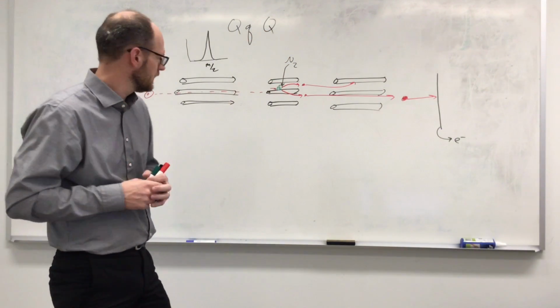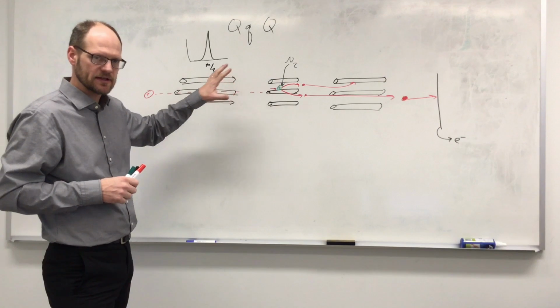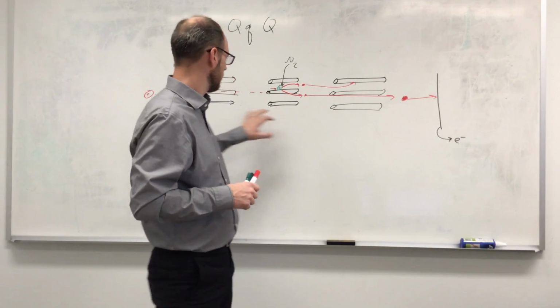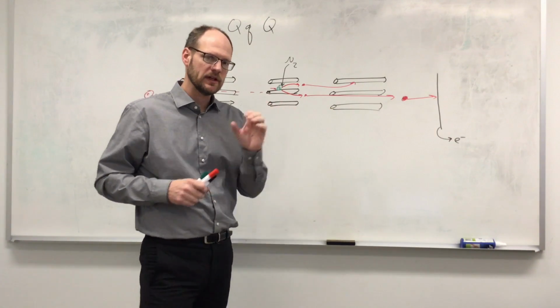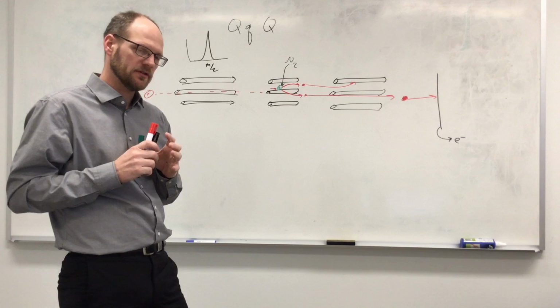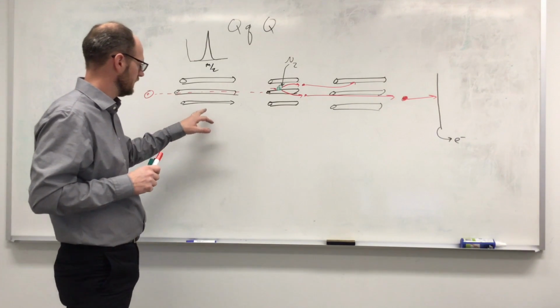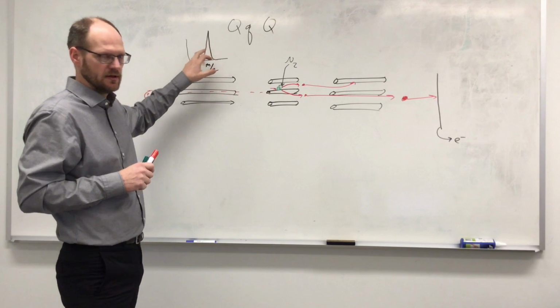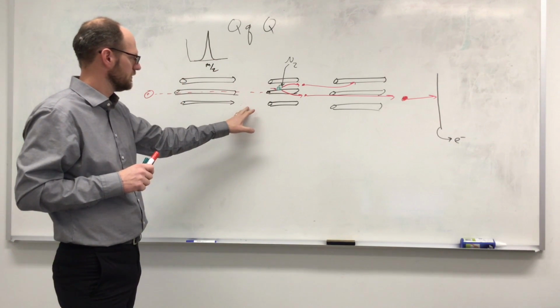So in summary, a triple quadrupole is a mass spectrometer with 3 quadrupoles. The first and the last quads are only used as mass filters, and the mass filter works by just setting the electric charge here such that you only get a particular m over z through the instrument.